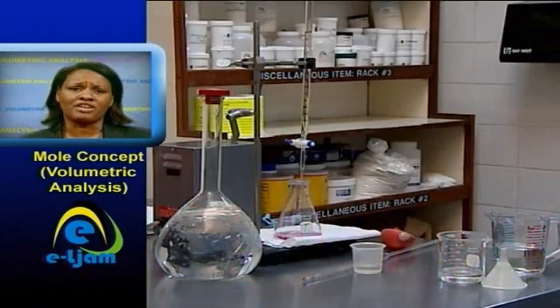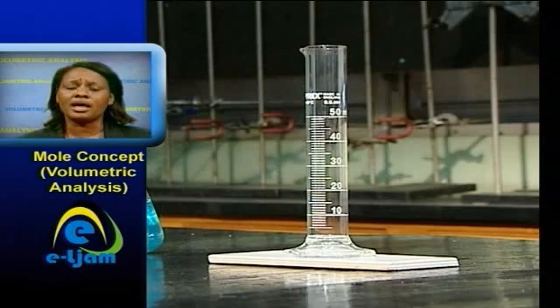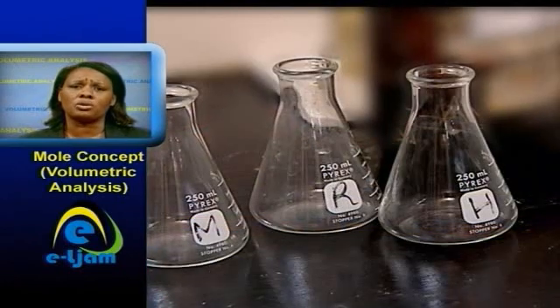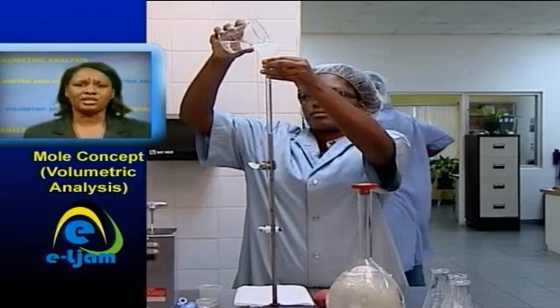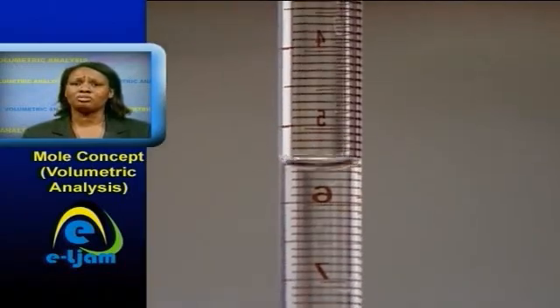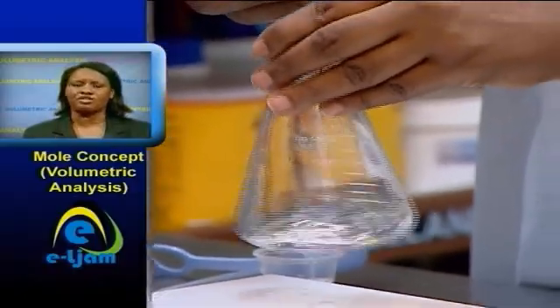These measuring devices provide a much higher degree of accuracy than measuring cylinders, while beakers and conical flasks give only approximate measurements. By employing pipettes, burettes, and volumetric flasks, the results of titrometric analyses will be reliable enough for most scientific work.